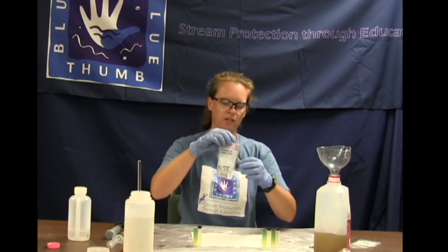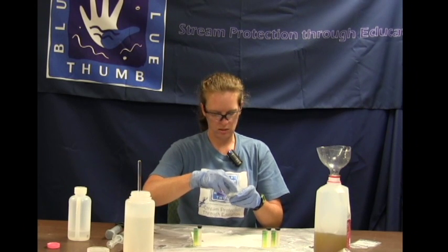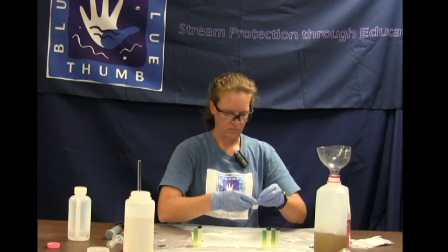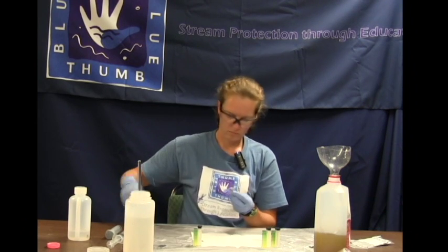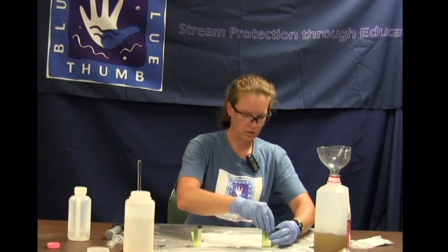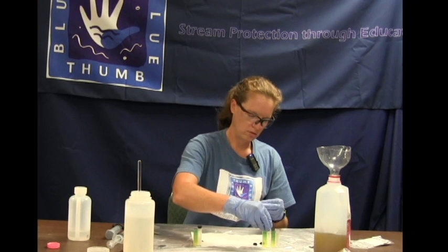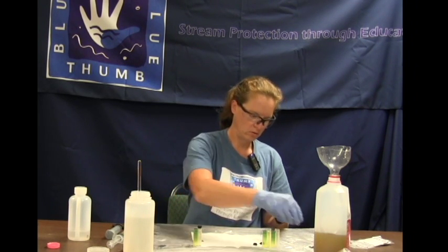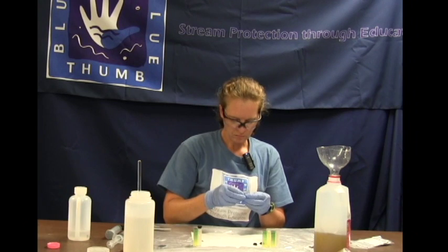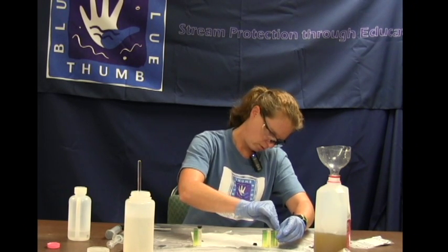Next comes the ammonia cyanurate, the AC powder packet. Each cube gets 1 AC packet. Just remove the black lids. Add the ammonia cyanurate, 1 packet per cube. That one needs to be cut a little bit more. Put the lids back on, nice and snug.